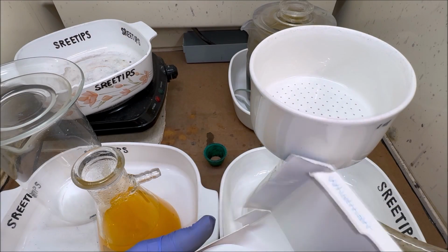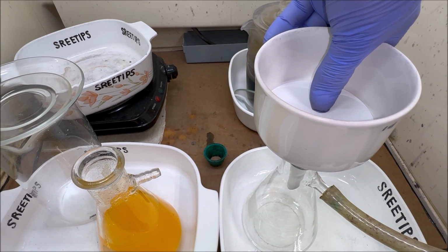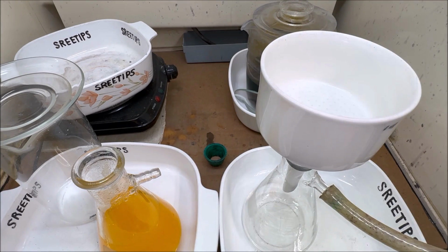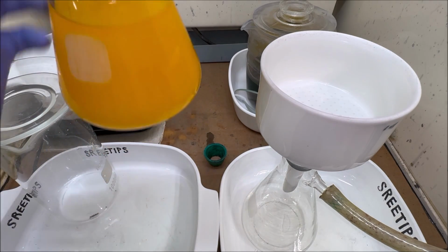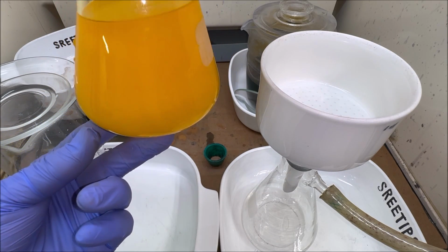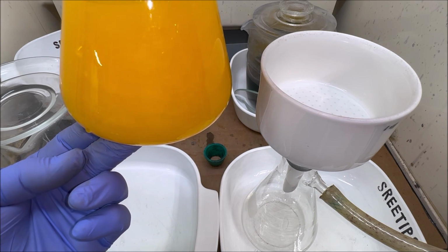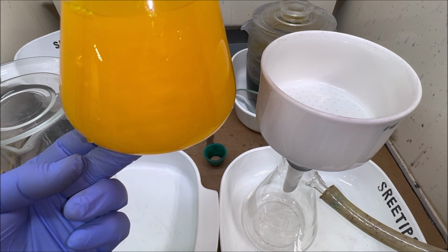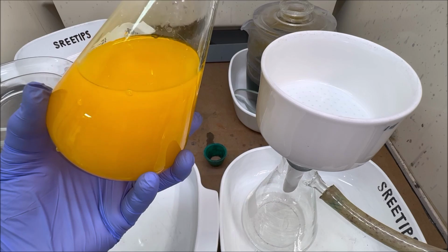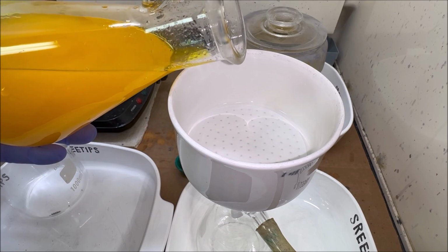Let's put a new filter in this filter flask. Get this set up to go here. And if you look, we do have some precipitate in there. It's formed. See it swirling around in there? That's from the sulfuric acid that we added. It must be the lead sulfate. The fabled lead sulfate that we all hear about.